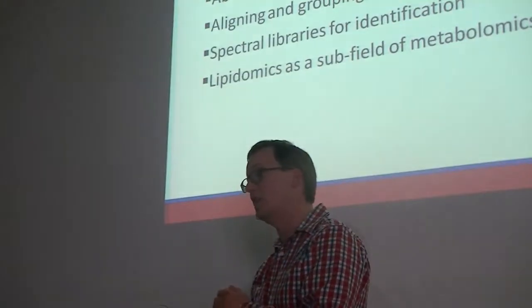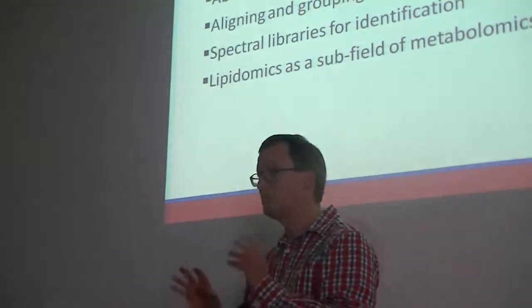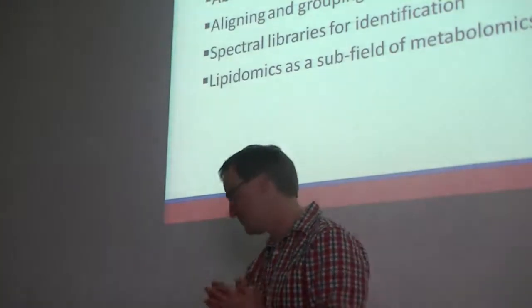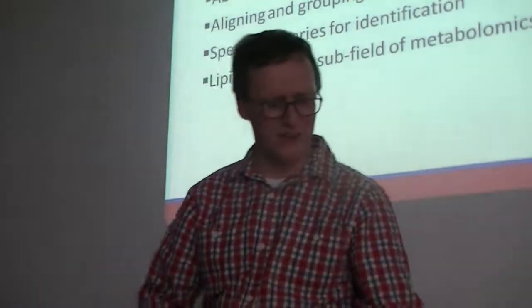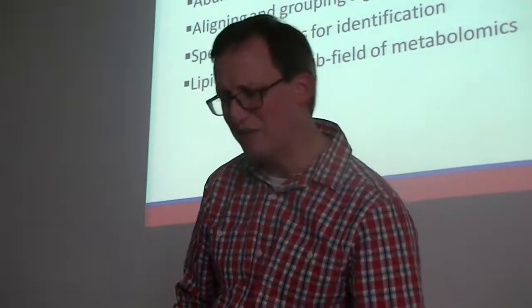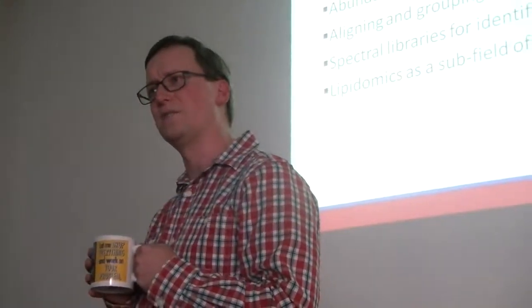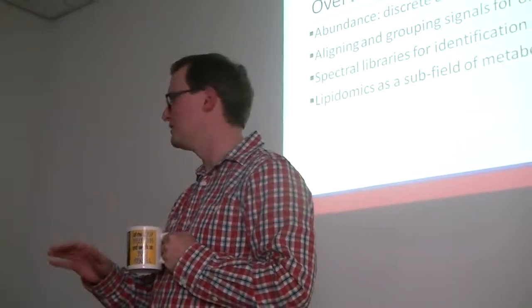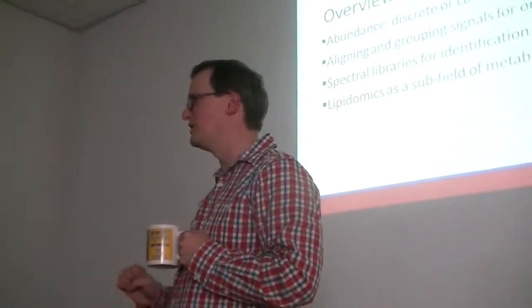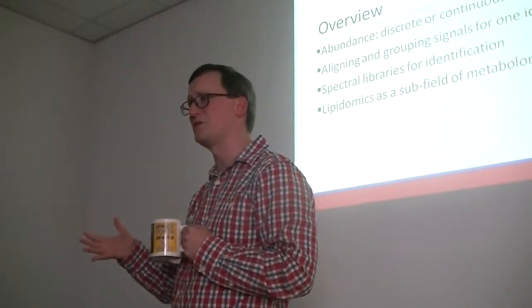I already mentioned that they have a fair bit of application in the space of proteomics. Today we'll discuss it in the context of metabolomics. And we'll also talk about lipidomics. Those poor guys in lipidomics, they kind of are caught between two worlds, in effect. The proteomics people tend to ignore lipids because they don't have sequences, and the people in the metabolomics world tend to dislike lipids because they're awfully big, and they have a lot of structural diversity.